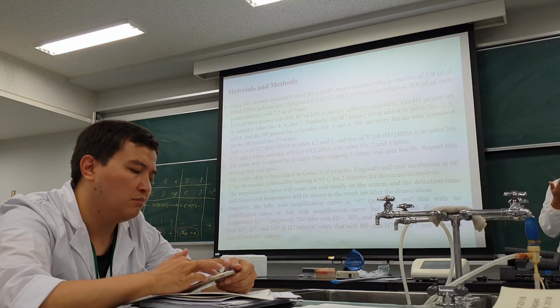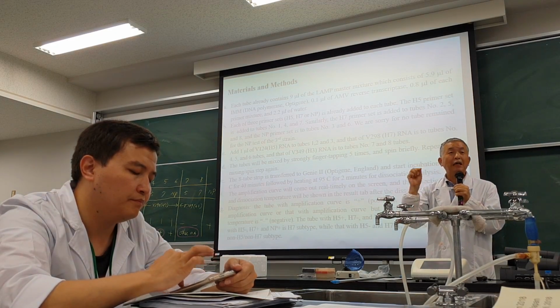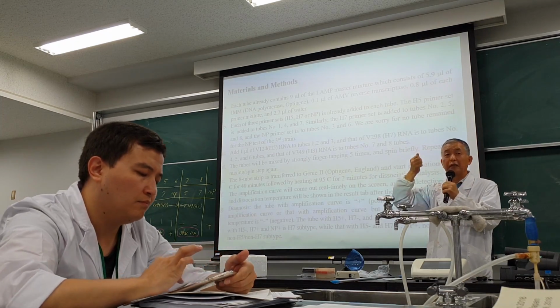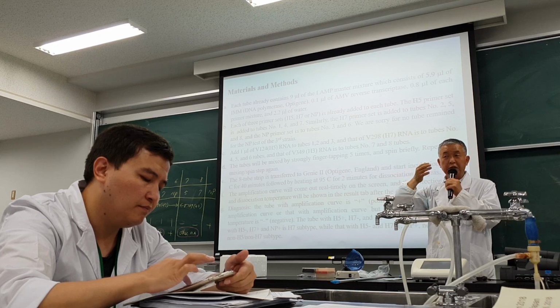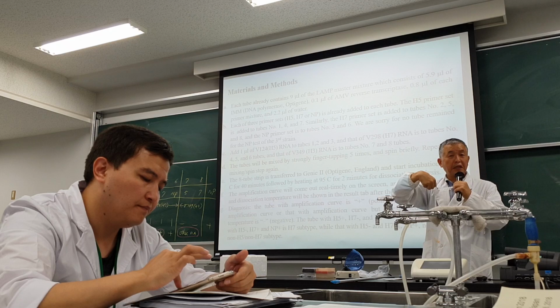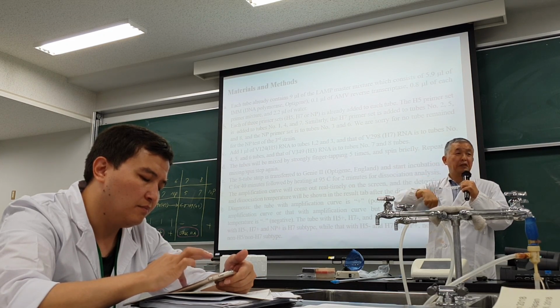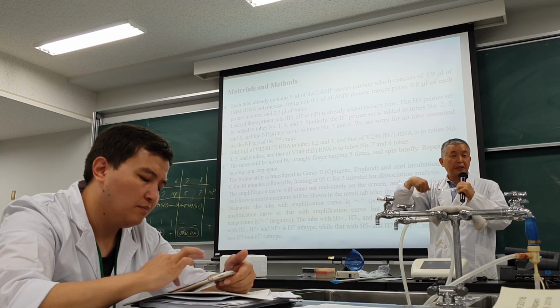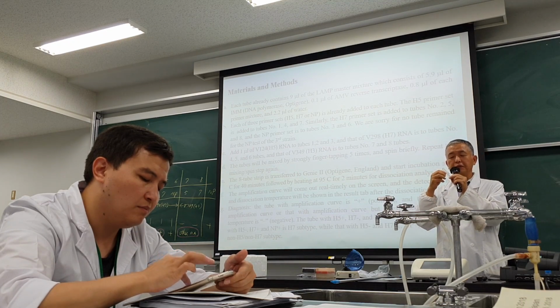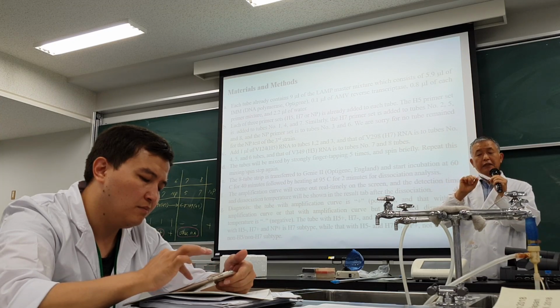Now the cap is set halfway. You can open it by hand, okay. After adding the RNA sample, 1 microliter each, using different tips, push the cover tightly until you hear the sound. That means the cap is locked. Okay, and after that, mix it by hand.